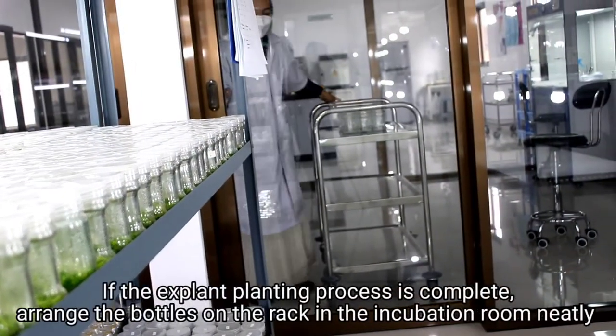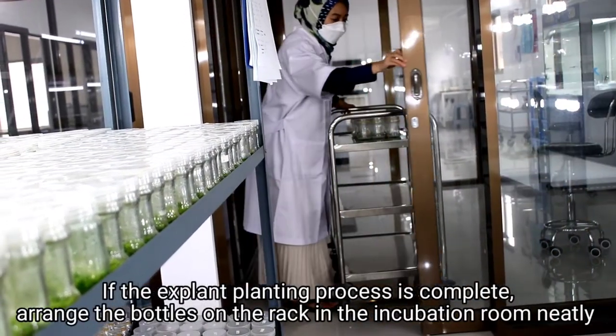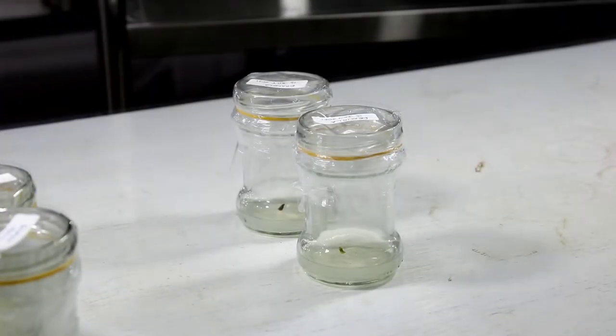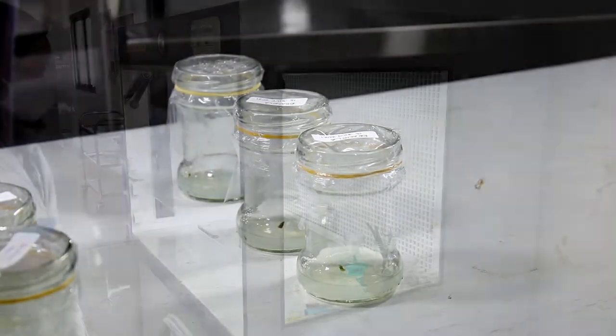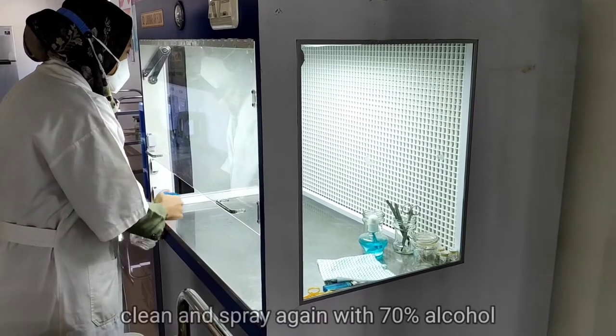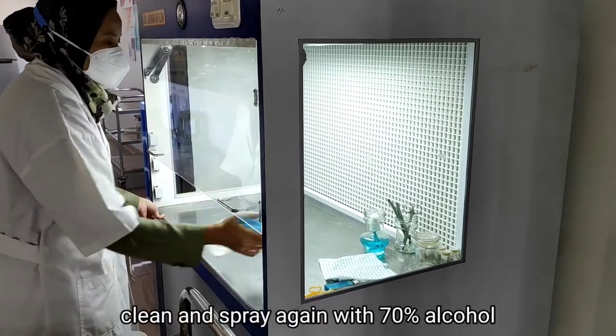If the explant planting process is complete, arrange the bottles on the rack in the incubation room neatly. Get all tools and materials out of LAFC, then clean and spray again with 70% alcohol.